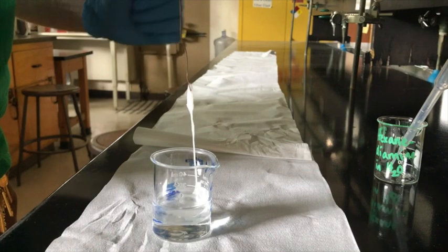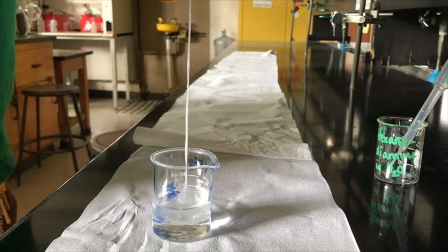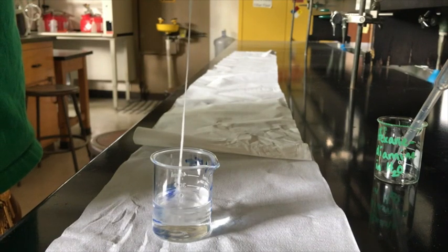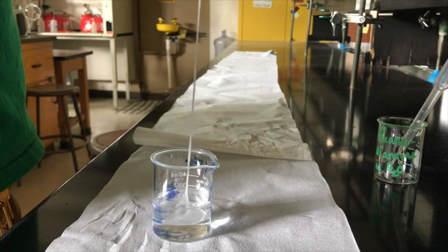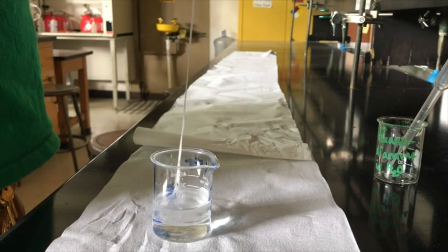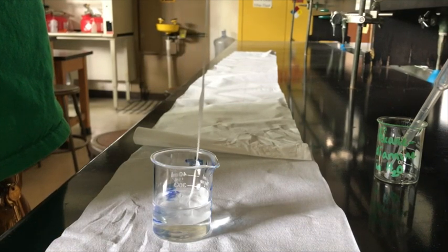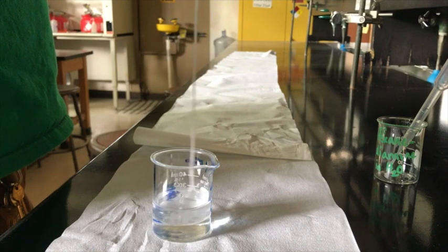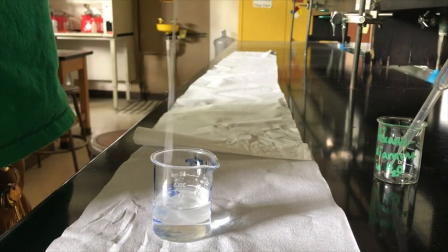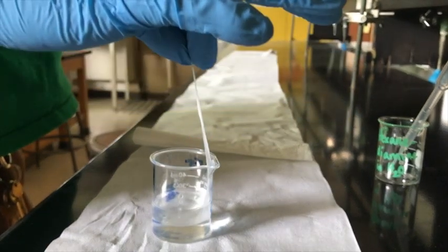Isn't that awesome? If I continue to pull slowly, I'll get a longer and longer strand of nylon. Our longest strand during the non performance enhanced era, where the student actually just used 10 milliliters of each solution, was done by Nikki Nylon. Hers was like 32 feet. Mine potentially could be longer because I used 15 and 15 milliliters.